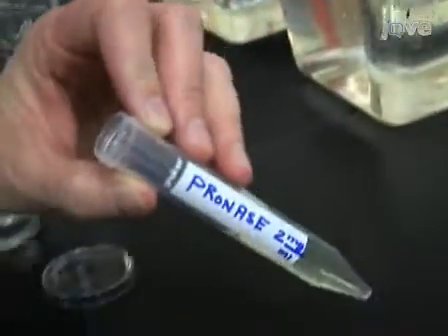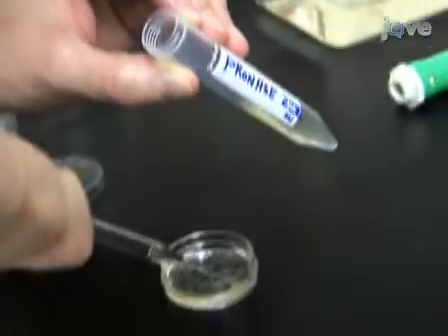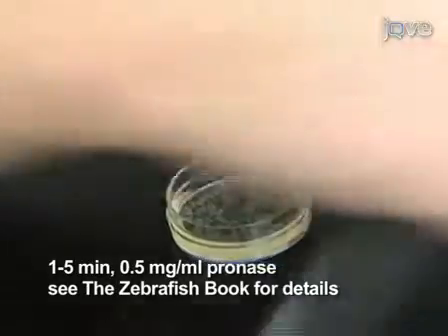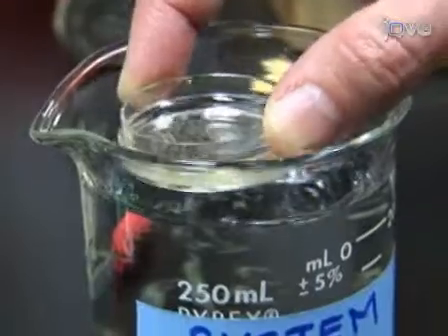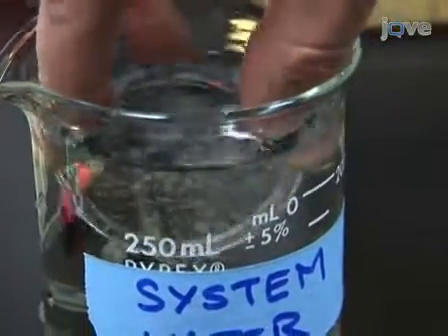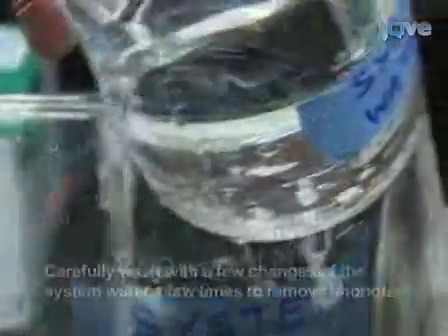Now proceed with the enzymatic dechorionation of one-cell stage embryos. Incubate the embryos at the one-cell stage for 1 to 5 minutes in a 0.5 mg per milliliter pronase solution. Monitor the dechorionation closely. As soon as the chorions begin to visibly collapse, submerge the embryos in system water.